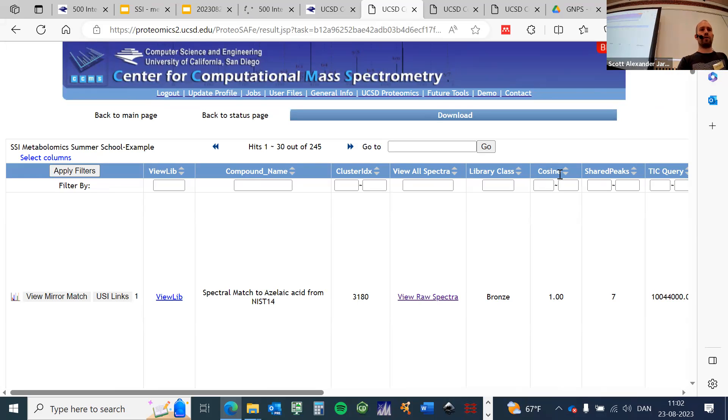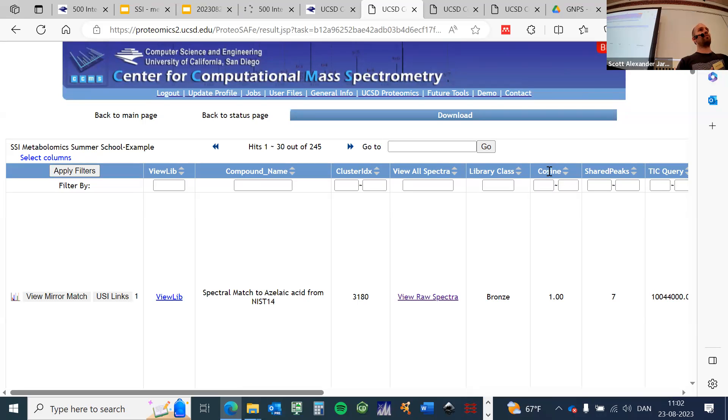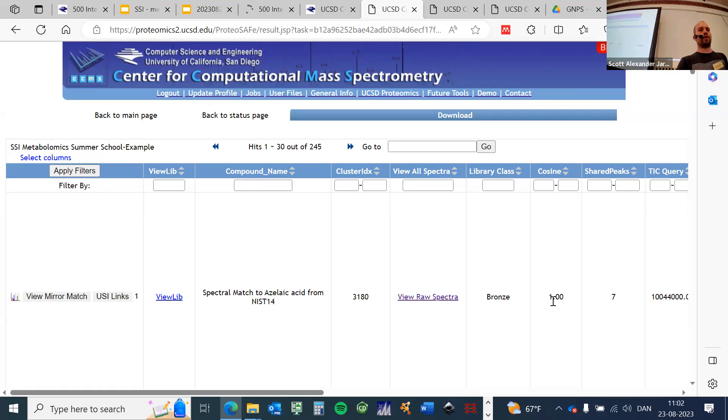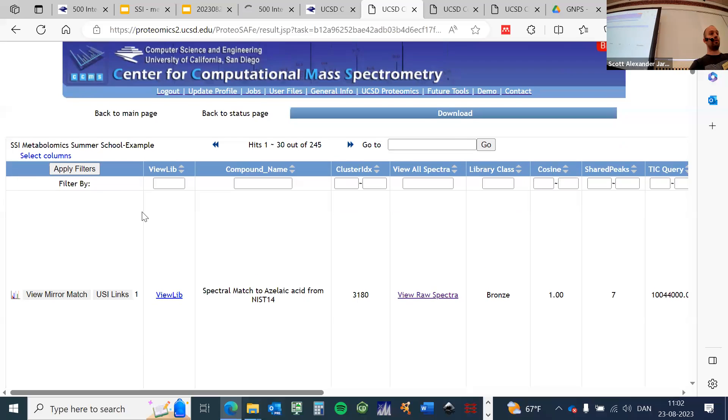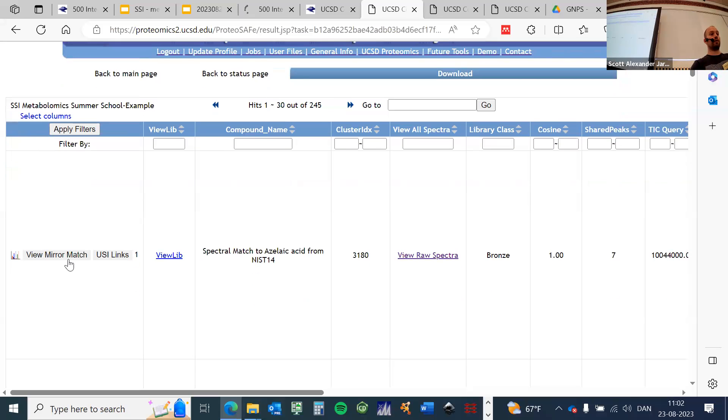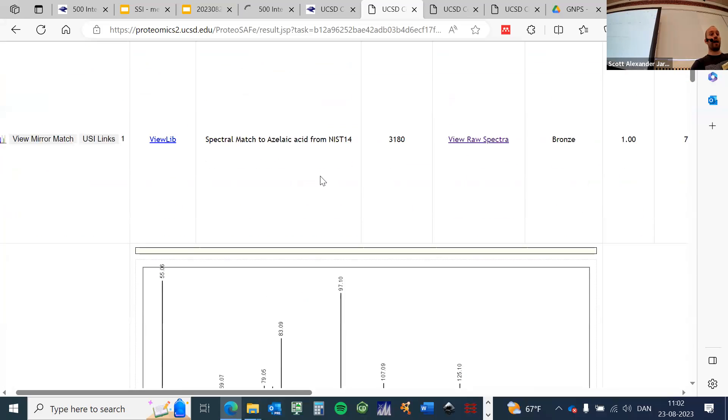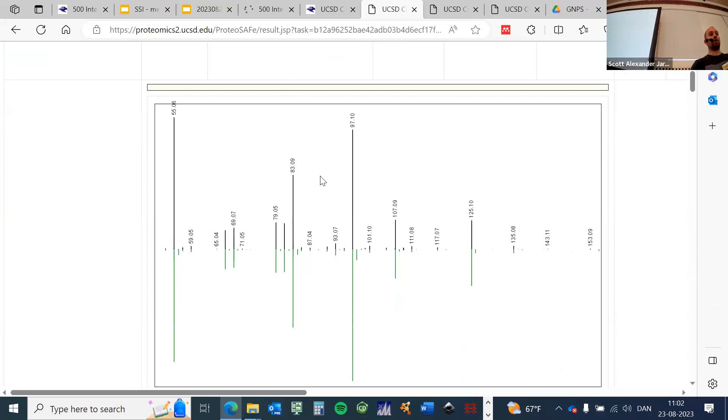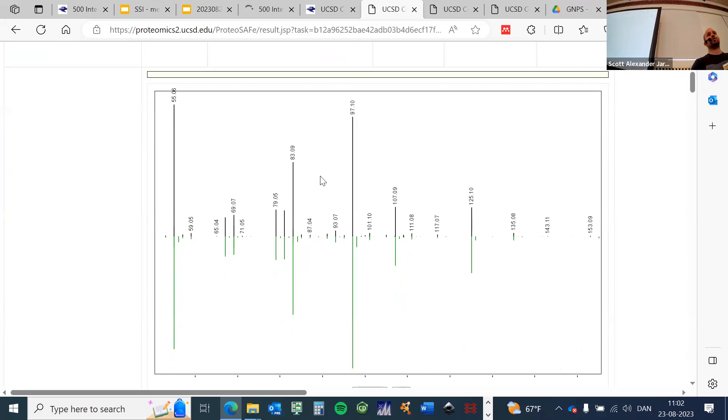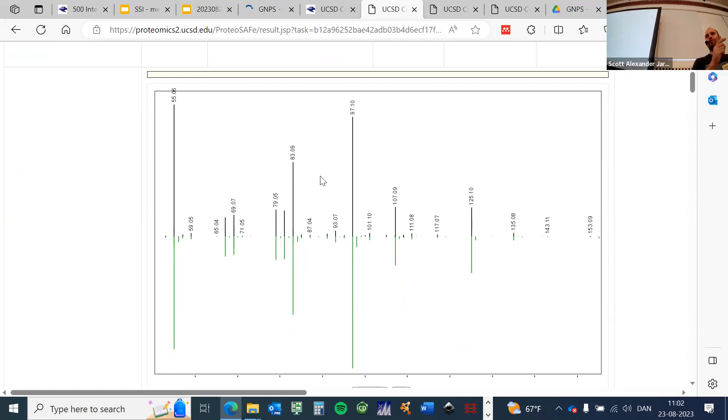It's directly sorted here by the cosine value. This is the matching score between the library spectra and your experimental spectra. One would be a perfect match. As Scott showed you earlier, you can click here on this mirror match and actually inspect the quality of your match.